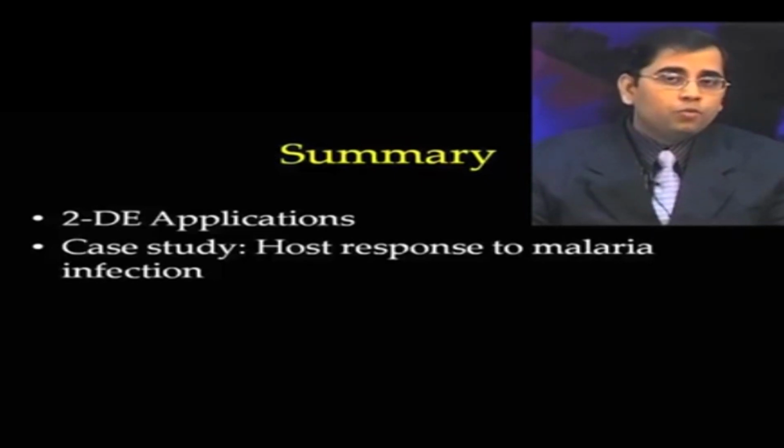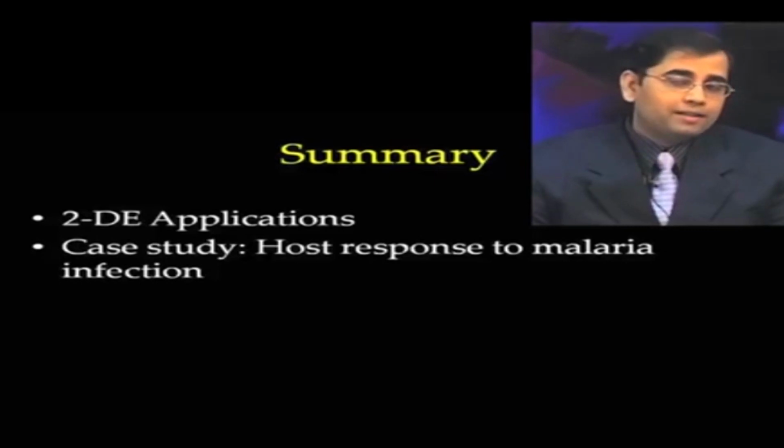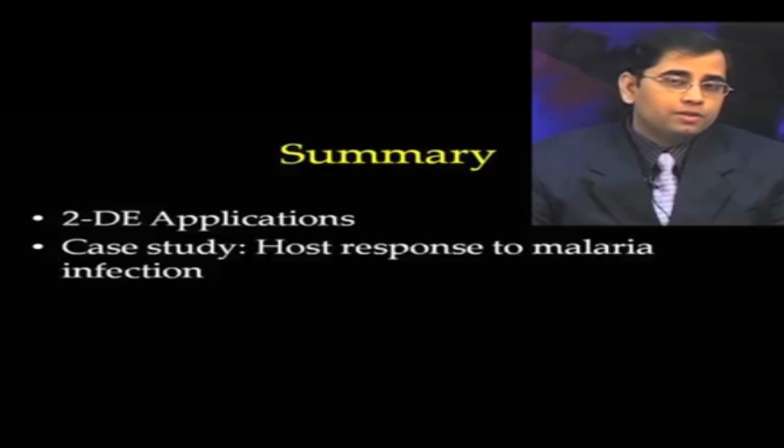So, today we discussed not only one application, how host serum proteins change due to one of the Plasmodium parasites, but also the various nitty-gritty experiments one needs to perform to achieve such a comparison. We will continue our discussion on some more applications of two-dimensional electrophoresis and also two-dimensional difference gel electrophoresis, because due to the variations in 2DE, people also try 2D DIGE experiments, which are very sensitive. So, that also expands the overall proteome coverage. We will continue our discussion in the next class. Thank you.